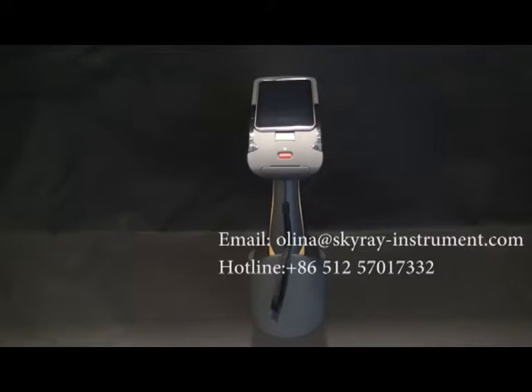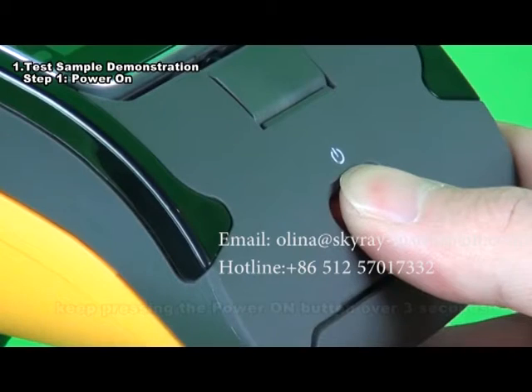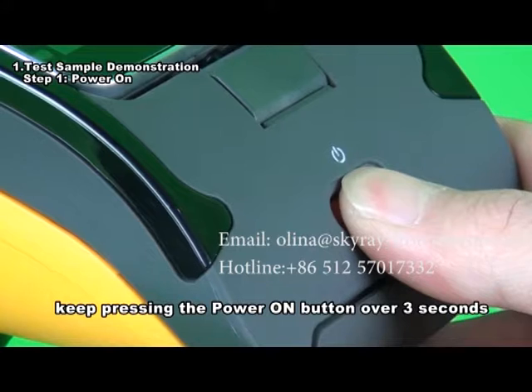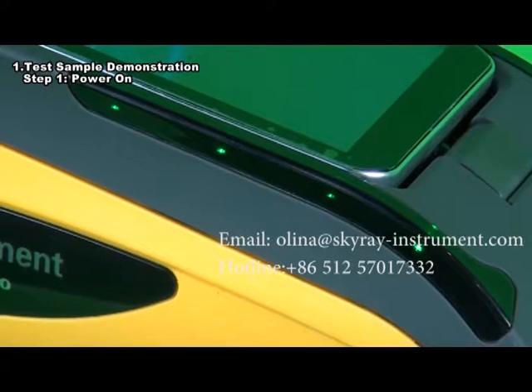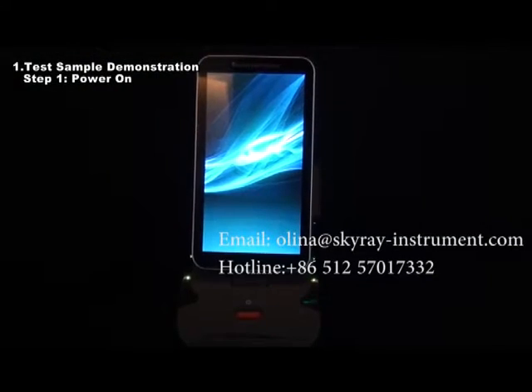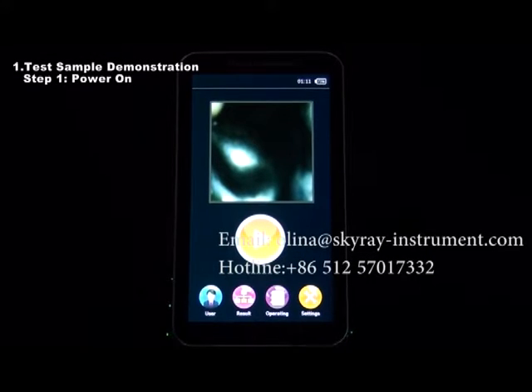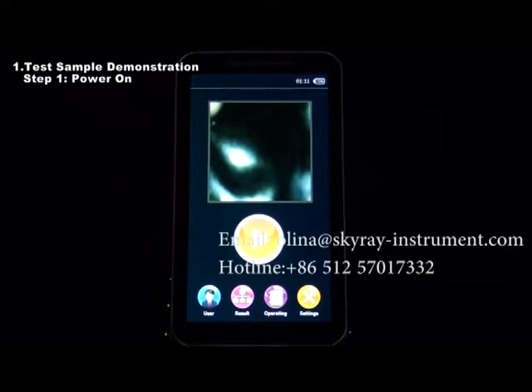Test — a simple demonstration. Step 1: Power on. For the handheld instrument, keep pressing the power button for over three seconds so that the power light flashes green. At this moment, the system will boot and the software will automatically enter the main interface in use mode. This process will last for about 60 seconds. Please wait.